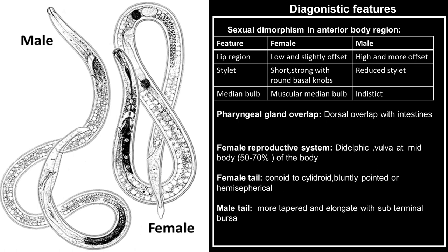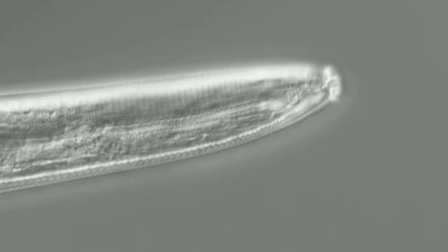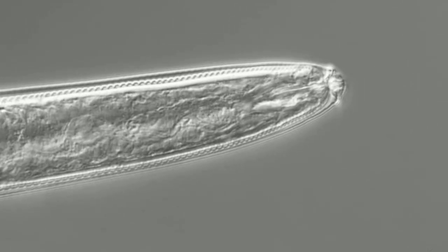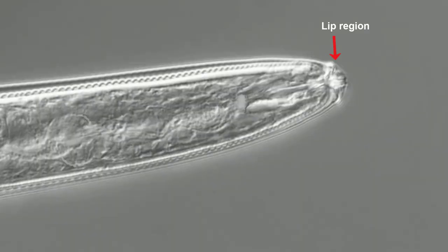For this practical exercise, we are going to use a female nematode. Let us start by putting the anterior end of our nematode in focus. Here we have the lip region of this nematode, and as you can see, the lip region is low and slightly offset. In the same field, we also have the stylet of this nematode, which is robust and has round basal knobs at its base.